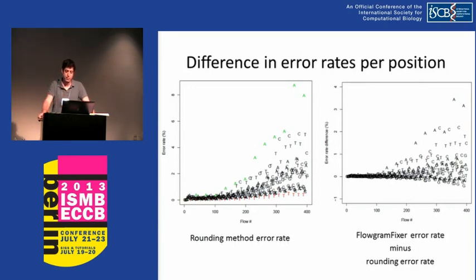Okay, I understand your point. What I was talking about is after alignment. So if you take your read before the alignment, when you call the bases for each read, you have two different ways. Is your way shorter or longer than the original one? It's hard to tell because if you place a prior on homopolymer length, you did not pay attention. We didn't, but this sort of pulls you towards a shorter read. But on the other hand, the fact that you're using a state machine prevents you from placing zeros at some places, so this pulls you towards a longer read. So it's hard to quantify, but that's a good point.